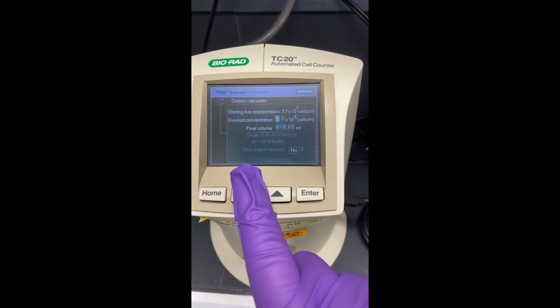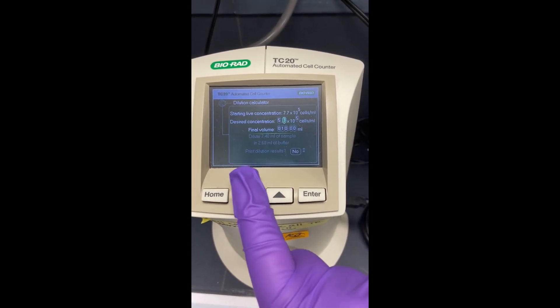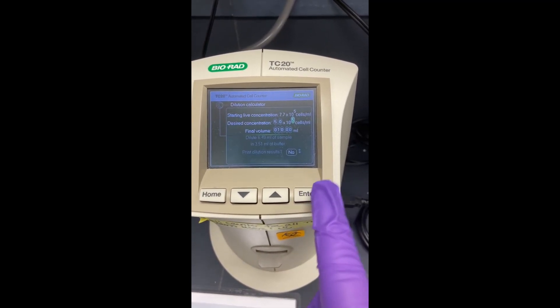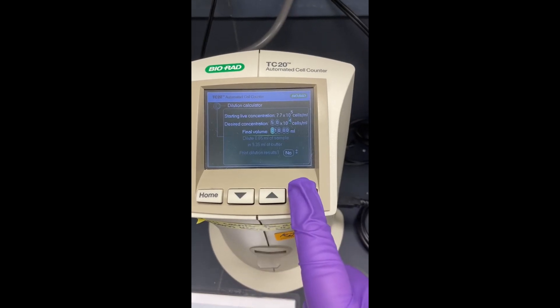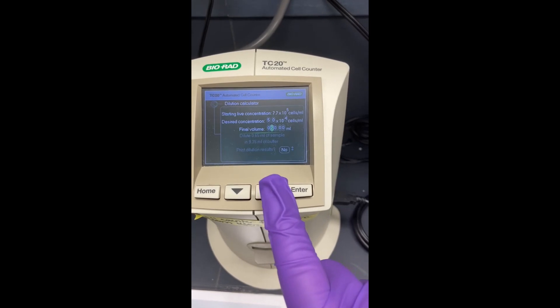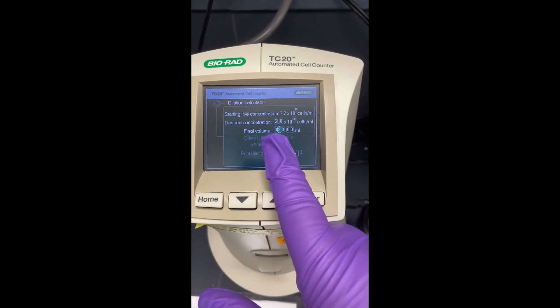And so for this experiment that I'm planning on doing, I need 5×10^4 cells. So it's a little push button where you have to push enter and then up and down. But you can tell it your final dilution and your final volume.